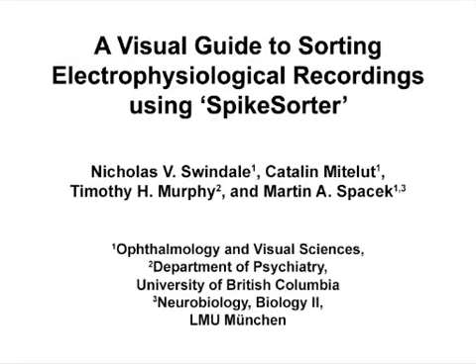The overall goal of this video is to show electrophysiologists how to use the program SpikeSorter to detect and sort spikes in extracellular recordings from neural tissue made with microelectrode arrays. Our goal was to provide a simple solution to this task of spike sorting using a program with a user-friendly interface. SpikeSorter can read files in a variety of formats and offers a variety of pre-processing and event detection strategies in addition to sorting and data export options.